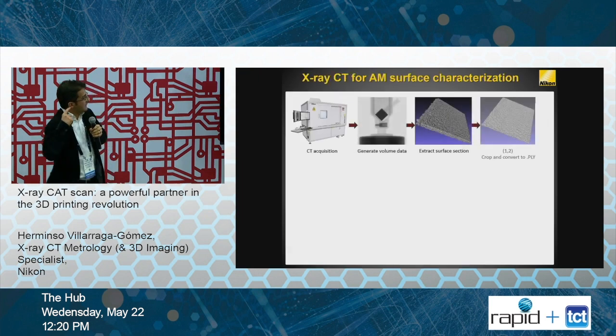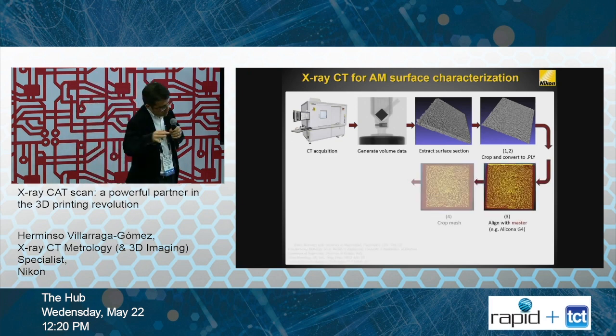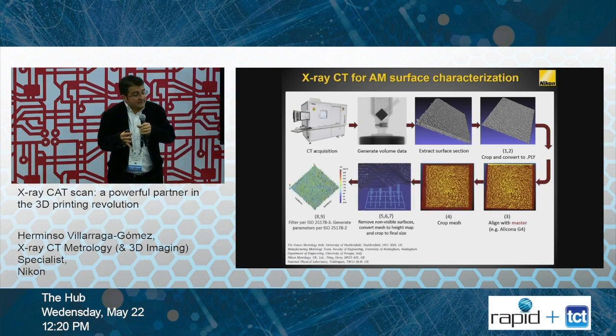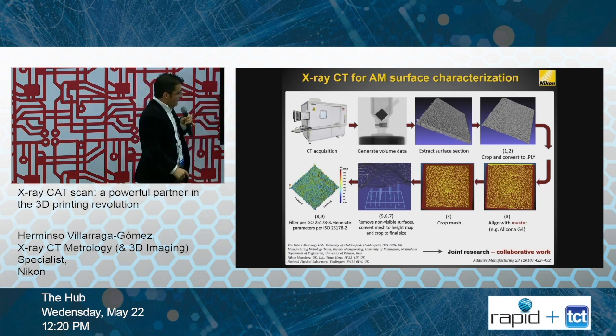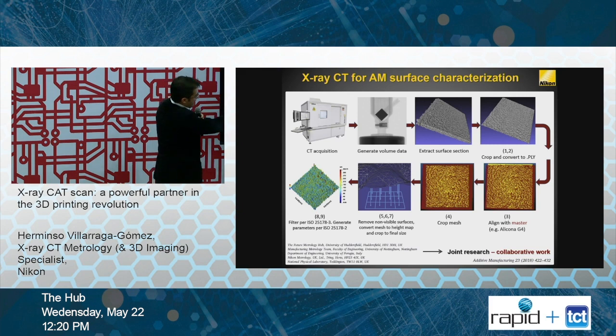This is another one which is quite novel, because usually the computer tomography is known to help with volume analysis, not for surface analysis. For surface analysis, you'd use other technologies. But, well, our friends at the UK, collaborators with our company and other university at Italy, has been dealing with this project, which is extract actual surface data from CT data and compare against another reference systems.